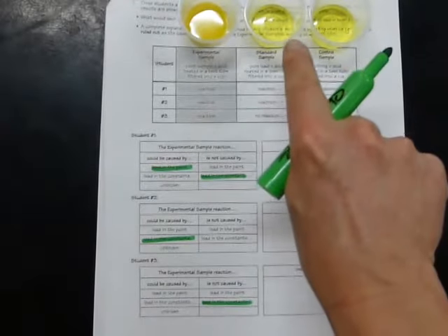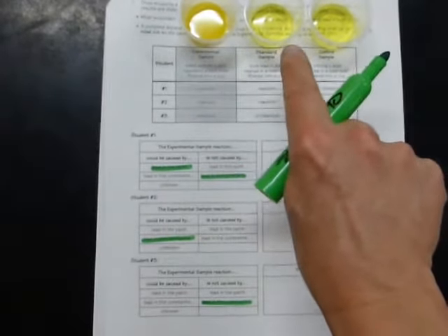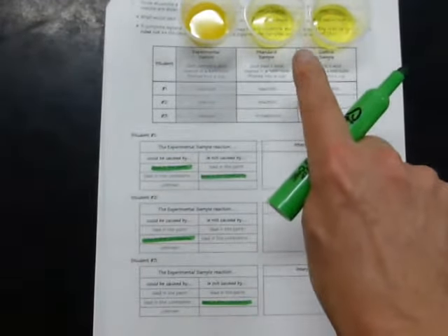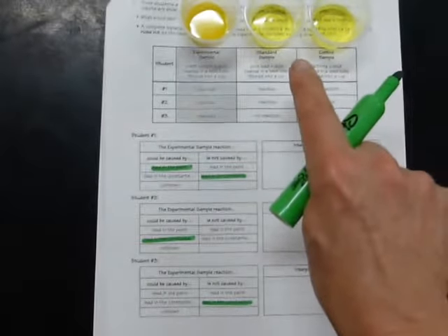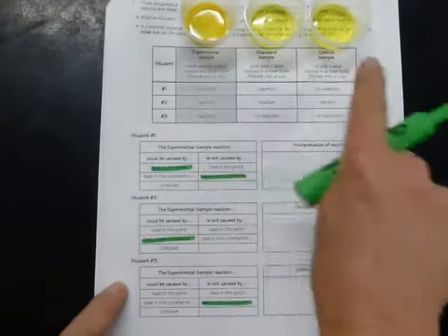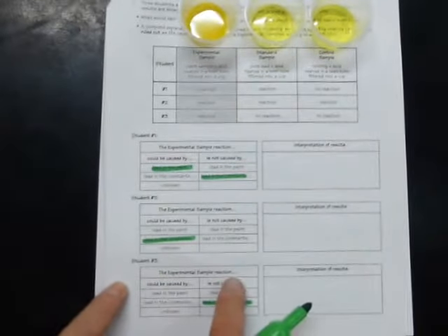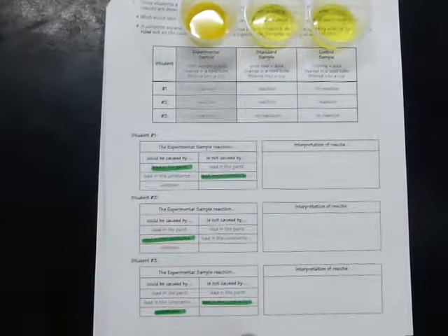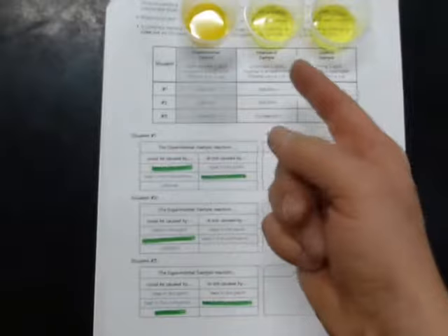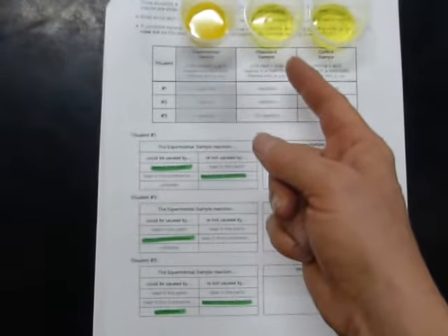Now this one right here is kind of a mystery, because if lead was put in there, there should have been a reaction, if lead reacts the way we think it does. But what if lead does not react the way we think it does? Then I don't know what caused this reaction to happen, because I have nothing to compare to that shows me what that reaction means. So the experimental sample reaction is of unknown explanation. I can't say why that one happened. I don't know what makes that reaction. If lead was really put in here, then maybe lead doesn't react the way that we think that it does.